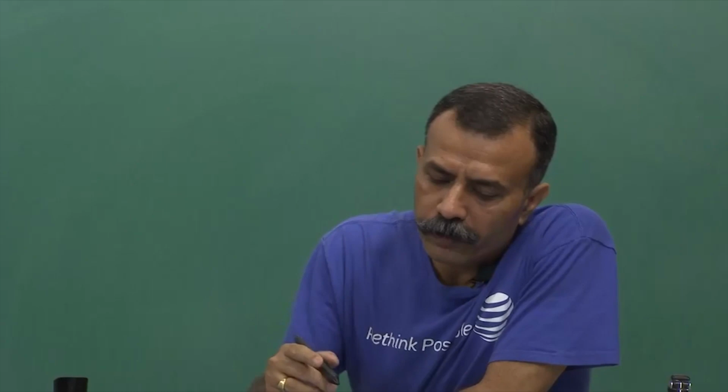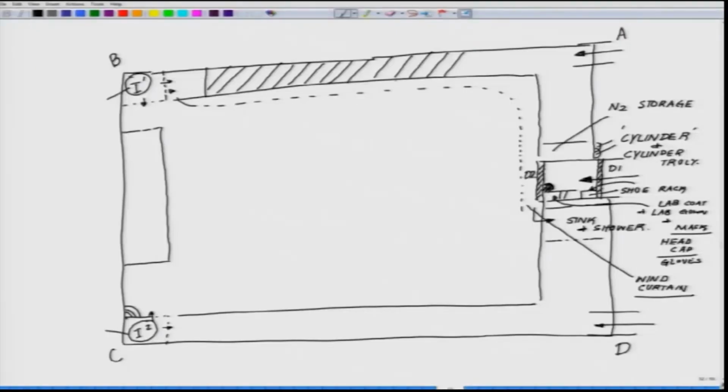Now, some people do something very interesting. They split the lab into two parts, like with the main frame like this, at two levels. So, this is the level. Say for example, you can make it of glass or something, or you can use even these walls for your storage or other purpose, or you can keep a microscope on these tables.